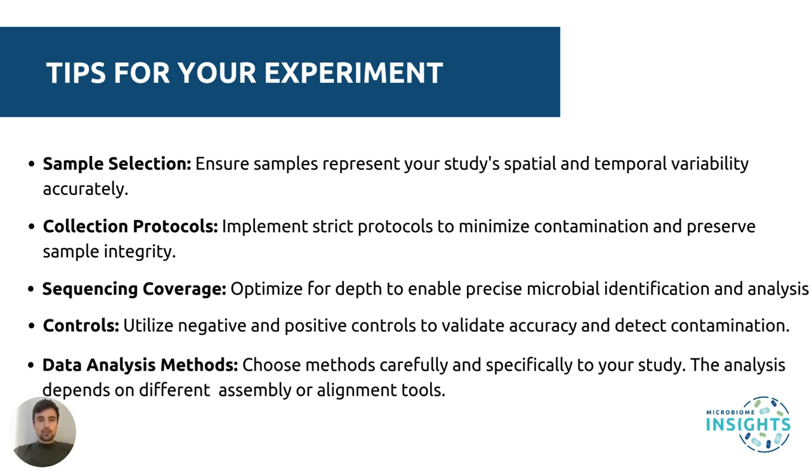sample selection, so making sure your samples accurately represent the spatial and temporal variability of your study area, and this will ensure your results are comprehensive and reliable. Collection protocols, so ensuring strict protocols are followed to prevent contamination during collection and storage. Then sequencing coverage, optimizing your sequencing depth to ensure the identification of all microbial taxa of interest.